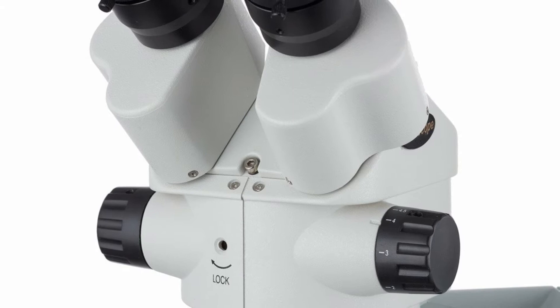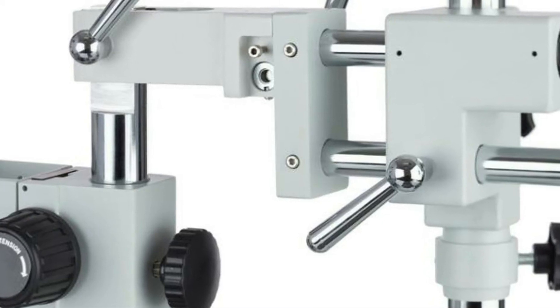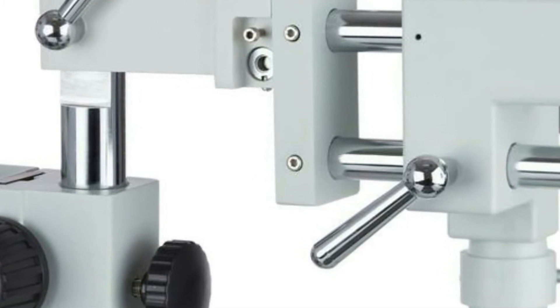The trinocular photo port is simul-focal, so it can be used simultaneously with both eyepieces. The stereo optics provide clear, sharp images with excellent focus depth and large working distance.